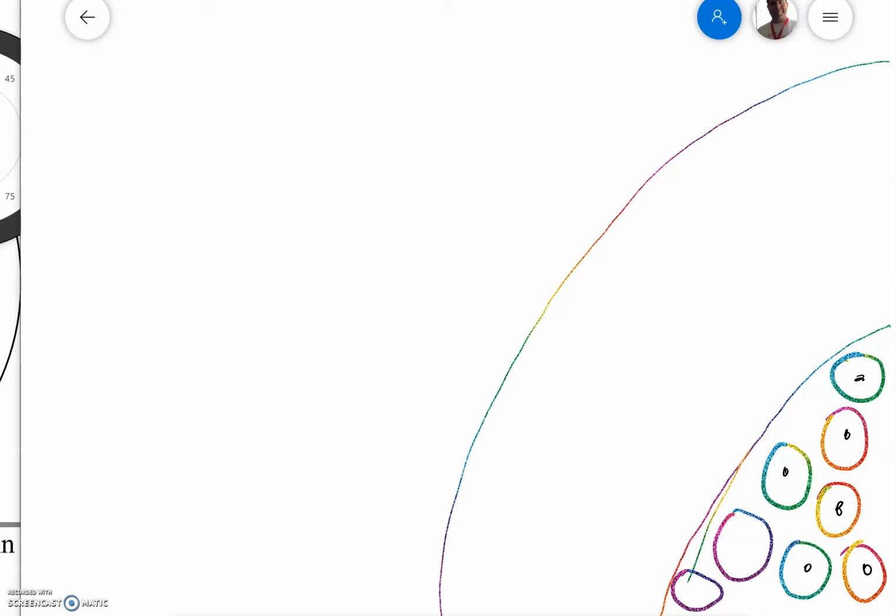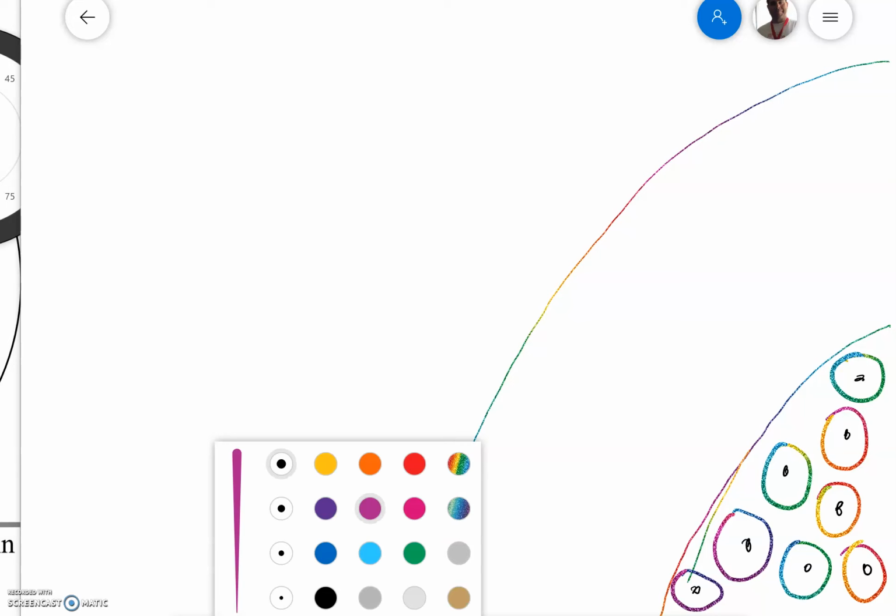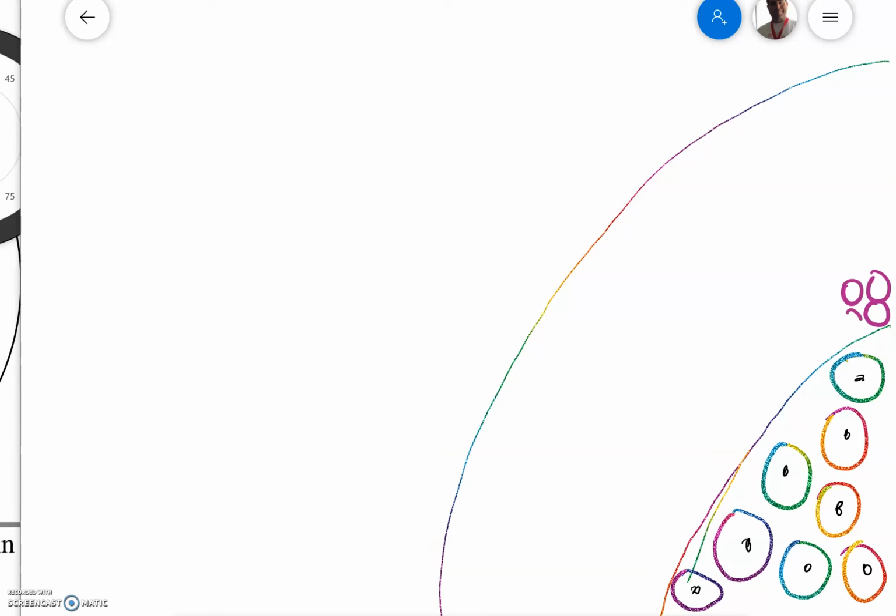And if you look under like 1200 times, you could see more of the neural tissue in here. But we're doing a magnification that shows both the cortex and the medulla. So this would be the medulla with the chromaffin cells. And sometimes you'll see a capillary going through as well. Now our cortex, which would be out here, is divided into 3 layers. Our first layer is the zona reticularis, and it makes testosterone and estrogen in both sexes. And in humans, it's not very thick, so we're just going to make it 2 cell layers thick.